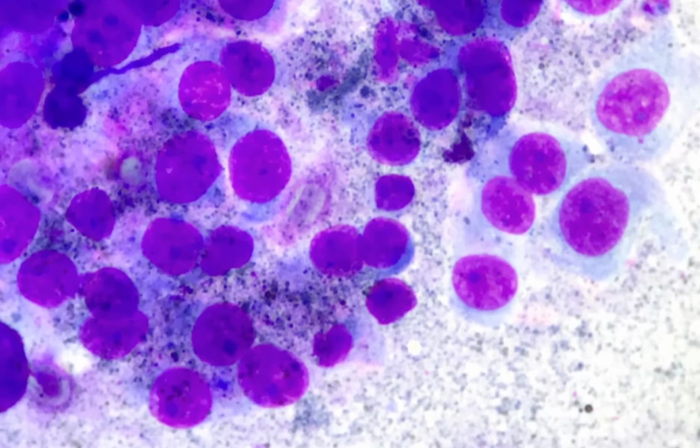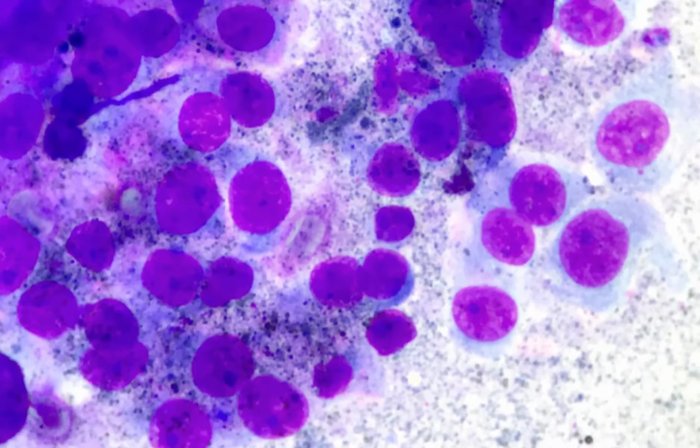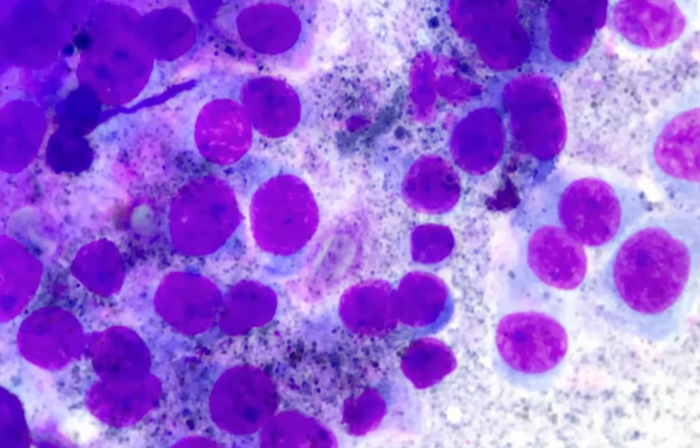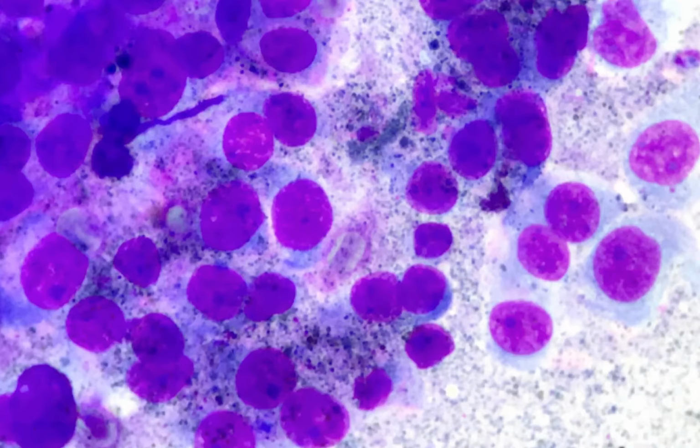And coming to the grading, and not grading exactly, benign tumors tend to appear uniform. They have minimal anisocytosis and anisokaryosis, and the mitotic index will also be really low, and benign tumors have very good prognosis. But malignant tumors like this have marked anisocytosis and anisokaryosis. The mitotic rate will be really high, and the prognosis will be really bad.